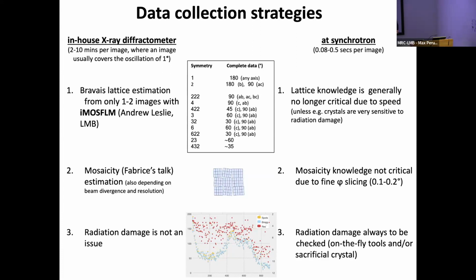You don't just have one crystal anymore. For your next crystal, you can either reduce the time that you're acquiring, or reduce the flux that you are delivering from the beam.